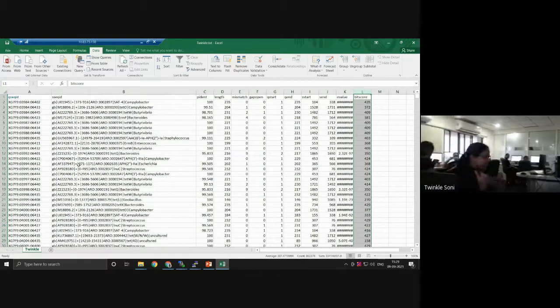It's in Excel basically. What exactly it will do is, first we will separate the AMR gene in a column. Second, we will have the corresponding bacteria. So a query ID will be there, a resistant gene will be there, and an organism will be there. These data will be useful to us. No doubt, if we even need to reduce our data, we can always increase the percent identity from here by removing others. But for now, as I already said, 95% identity is okay for me.